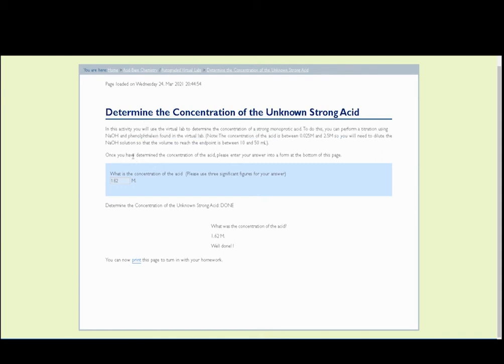It's going to be like adding the acid, adding the base, adding the indicator, waiting for titration. For some you're going to have to use the half equivalence point. I think for the first one, if you're doing pKa and stuff like that, you're just going to go halfway. You're going to find what halfway is to when it turns pink, and then do that.